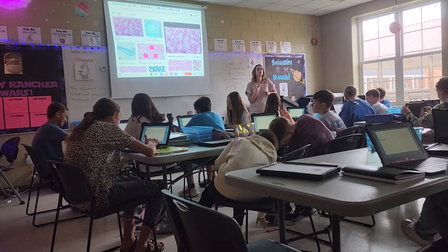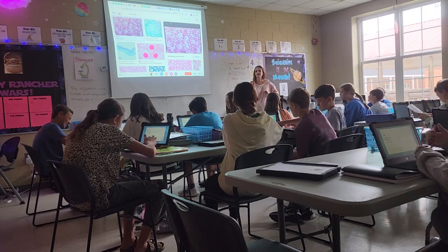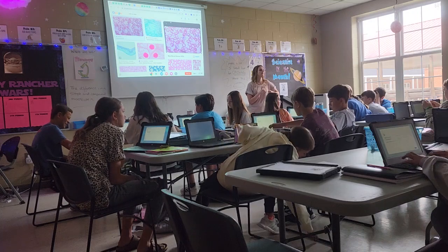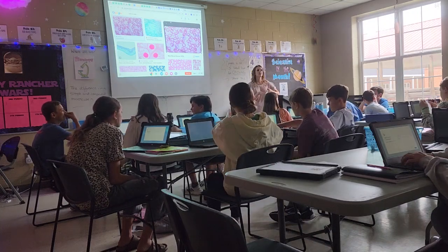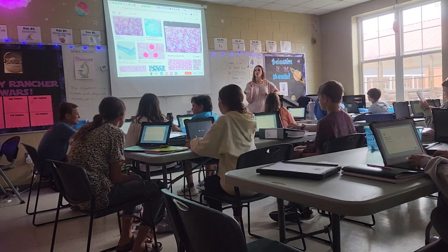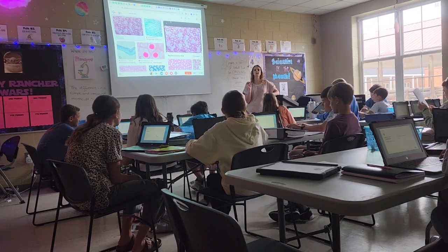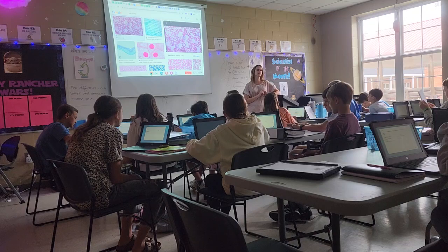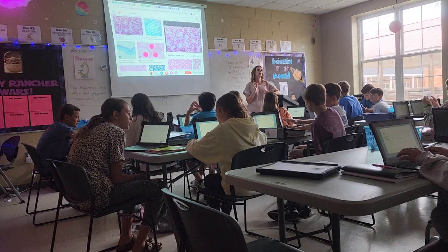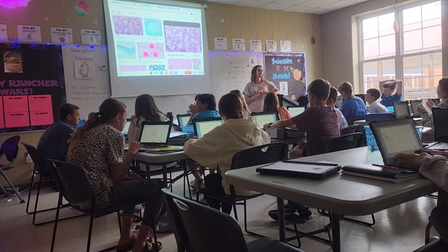Now, while we are doing this lab, you are going to be looking at different slides. It's going to talk about how to prepare different slides, what the proper procedure is, and how to take care of your microscope. When you get to the portion where you're looking at slides, I want you to take a screenshot if you find something interesting, and I want you to be able to share it with the class. You're going to email it to me, and we're going to look at it together on the projection screen.